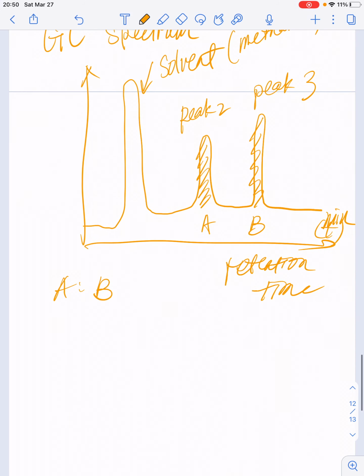So now there are several questions you want to consider. Firstly, retention time. What does it tell you again? Well, we mentioned that the longer it's staying in your column, the longer the retention time will be. That's going to mean your product is more polar or less polar.